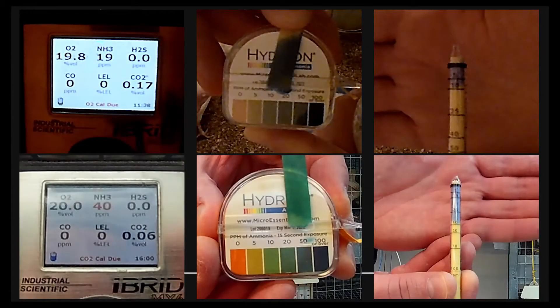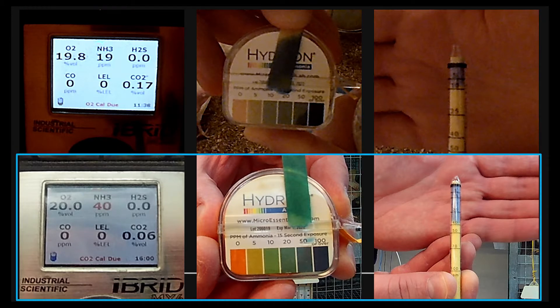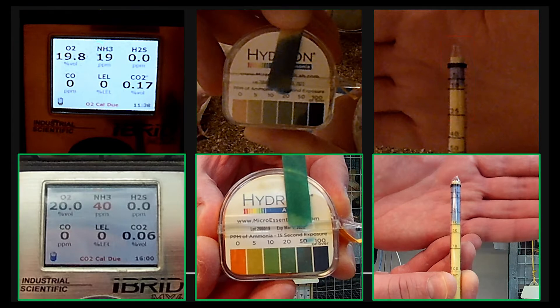Let's look at the instrument measurements side by side, discuss the differences, and talk about how these can be used on your farm. The images along the top show the measurements taken in the turkey pen and the bottom images show the measurements from the environmental chamber. The measurements from the handheld gas monitor and paper test strip agreed in the turkey pen, but the pull tube measurement was too low. And all measurements taken in the environmental chamber were in agreement. So which measurement do you trust, and how is each one useful?